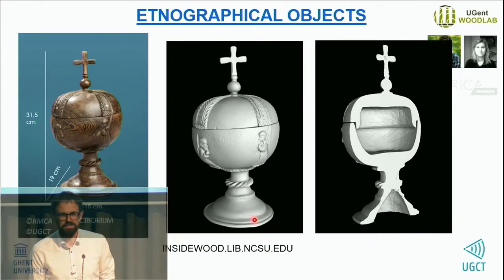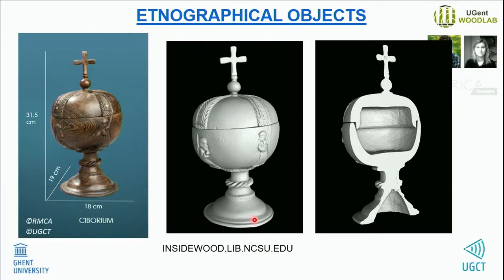One of the things that was mentioned during the questions of the last presentations, these libraries for wood identification. So this is one of them. Apparently, again, I'm not a wood specialist. And this was used to date this object as well.